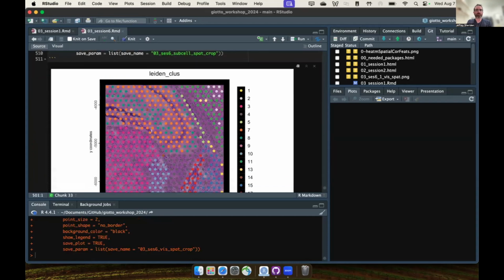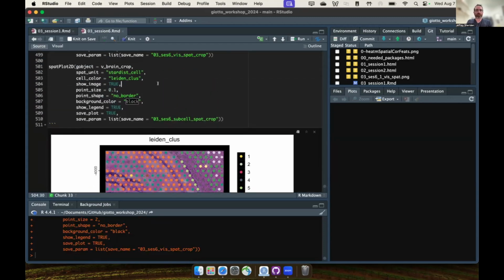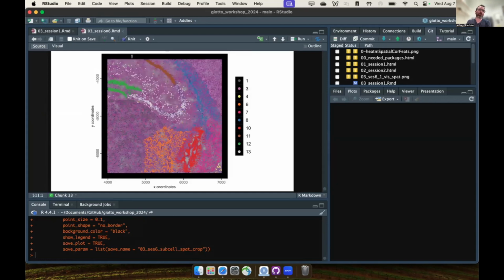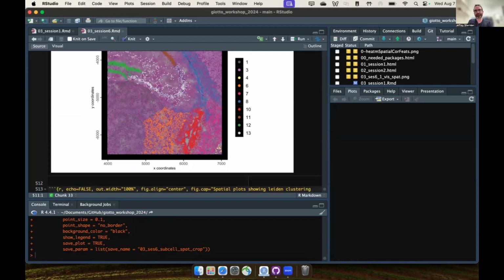And so we again visualize the normal Visium data. You can see the structures within it to a degree, but if we look at the interpolated gene expression, we can see much finer details within each of these structures, which is showing the power of this method to better understand what's actually happening in the tissue, especially when we're using some of these low resolution spatial technologies.